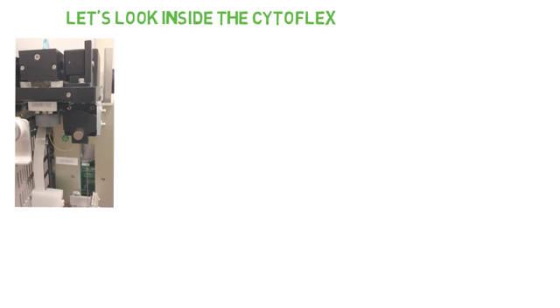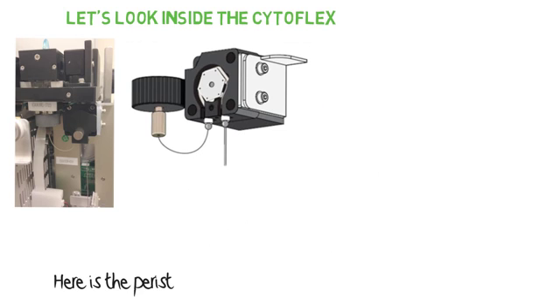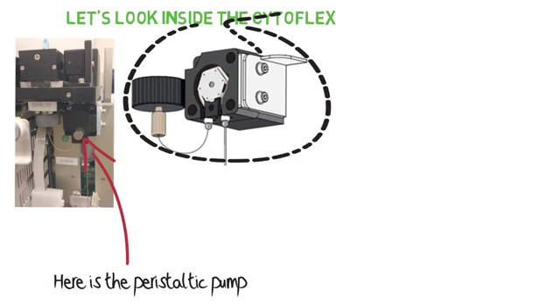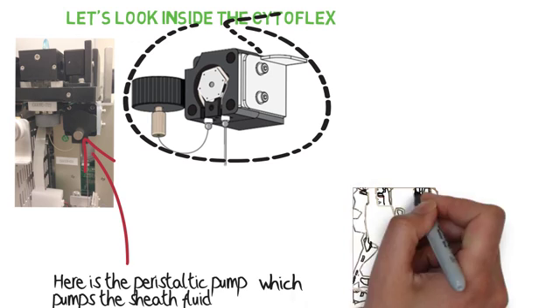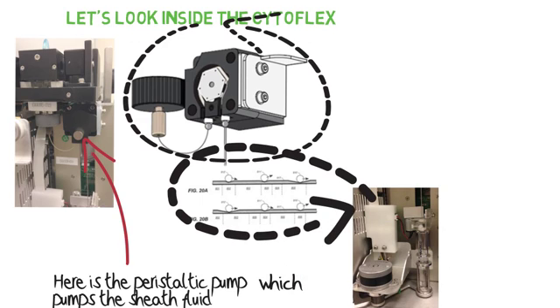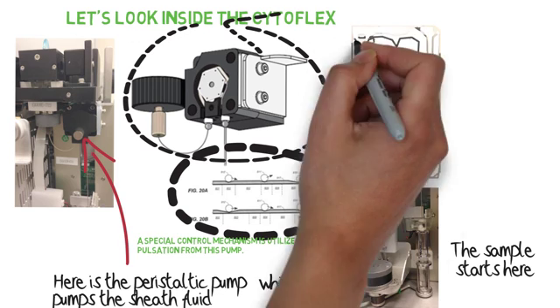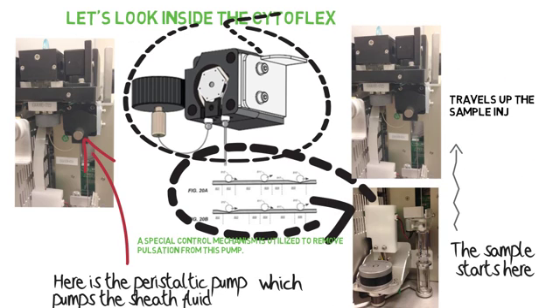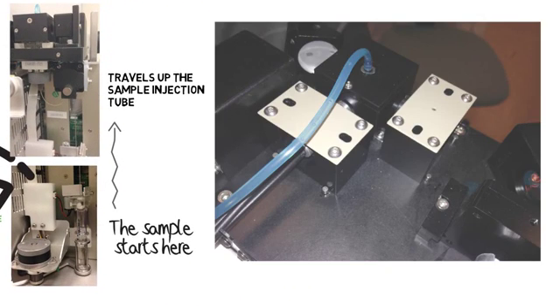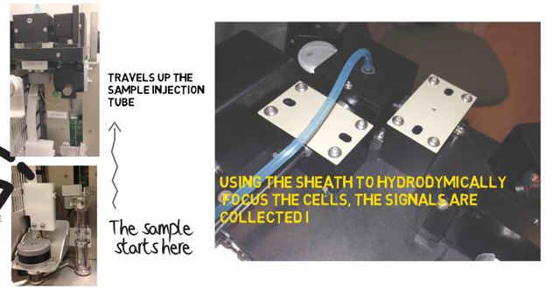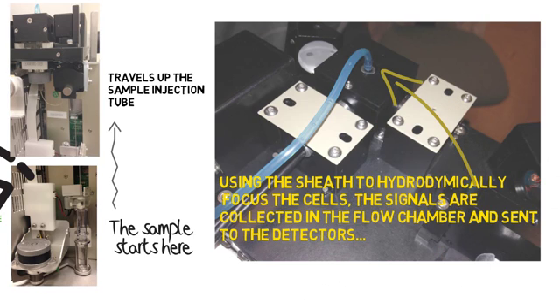Let's look inside the Cytoflex. Going through the fluidics, we see the peristaltic pump here in the center of the instrument. The sample is collected from the sampling station and transferred to the flow chamber. The Cytoflex peristaltic pump design removes pulsation through physical modification to the roller mechanism and computer feedback algorithms to control movement of the pump. This special design combined with computer control reduces pulsation and increases precision. The flow chamber uses hydrodynamic flow to create a single particle stream which passes by each laser line and out to the waste station.